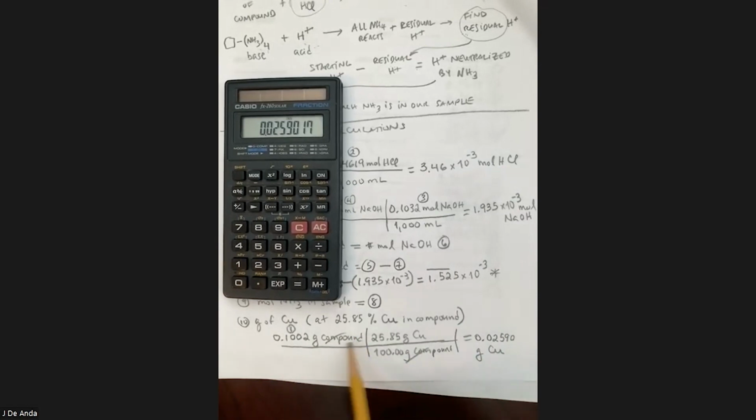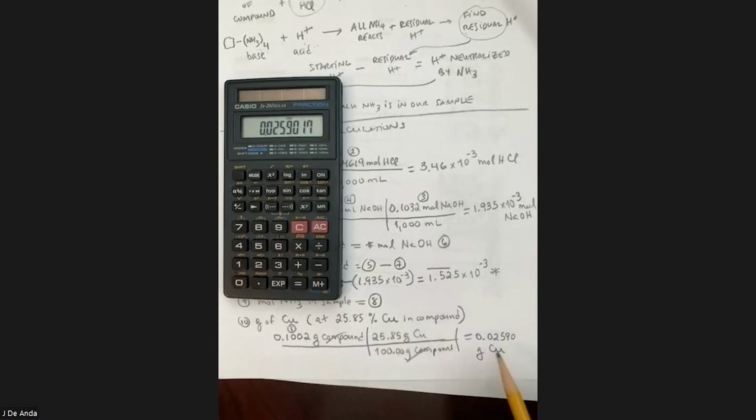Again, let me repeat that. We're trying to find out in this sample how much of that mass is copper. We said that we're going to use the value 25.85% of copper in the compound, but whatever you found in part 2, you may want to use that one instead, kind of like keeping it all in the house. But I'm going to use this one just for the sake of this example. So this is how many grams of compound I have based on item number 1. And this is 25.85 for every 100 grams. That is how many grams of copper we have in here.